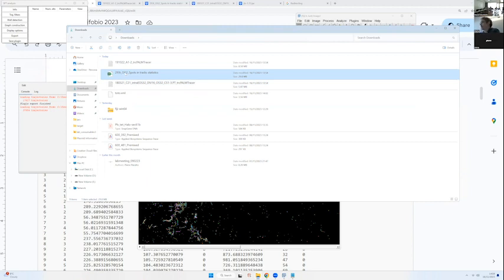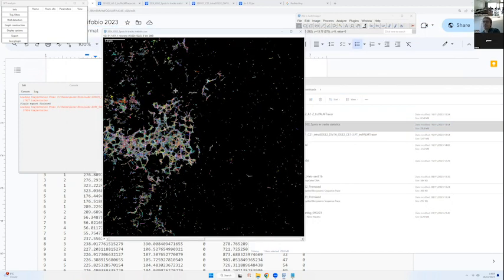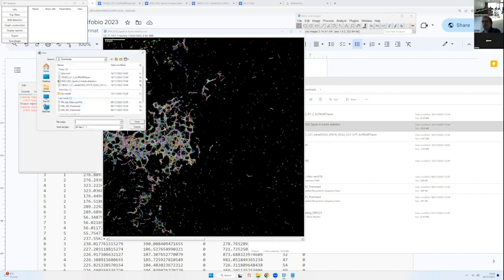Okay, you go to TrackMate here. Right, you click on use window, click on this here, and now you go. Okay, good. You have it. All right, now we can also save it as a plugin file. Wait.